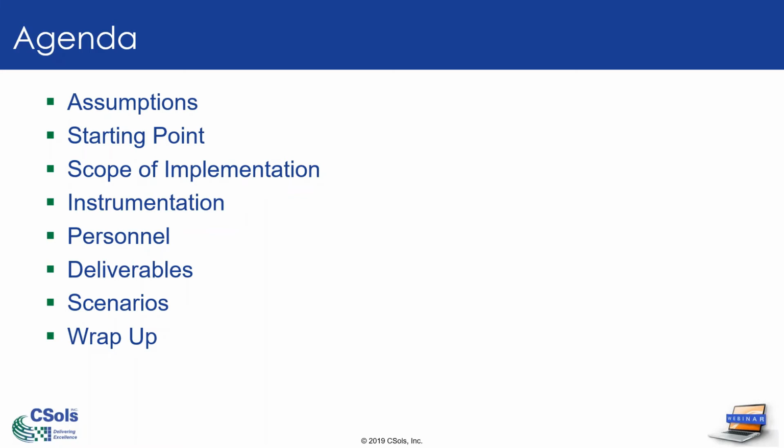So talk a little bit about things to consider along the way with starting at a starting point, talking then about during the scope of implementation, a little bit about instrumentation and personnel, talk about the deliverables that are typical with implementing and validating a CDS, provide some scenarios, and then just a quick wrap up at the end. And as Brenda mentioned, if you have questions, comments, go ahead and submit those, and leave some time at the end. I can come back around and try to answer those for you as well.